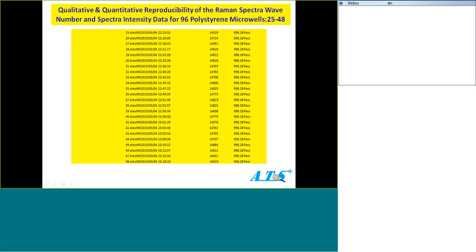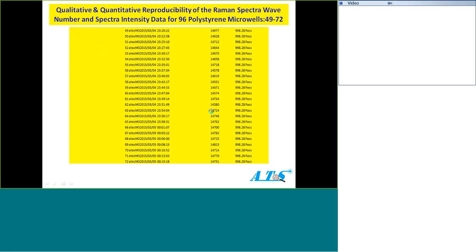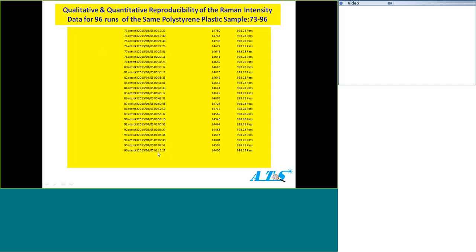Okay. And the next data, you can see after 48, same thing, 998.28. And again, 14,000, whatever. And the third, 972, same thing. Through the 96, all of them are the same. So you can see our system, because we are using robotic control, everything without human handling the Raman detector, everything in the dark room, fully controlled by computer, optimized by computer. So we can get this kind of data.